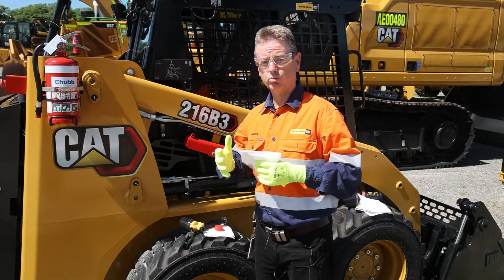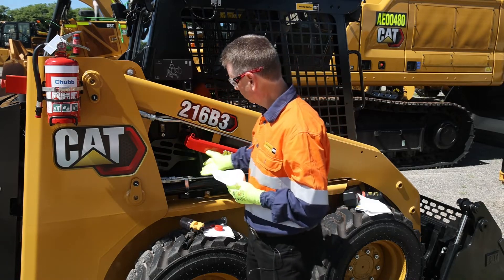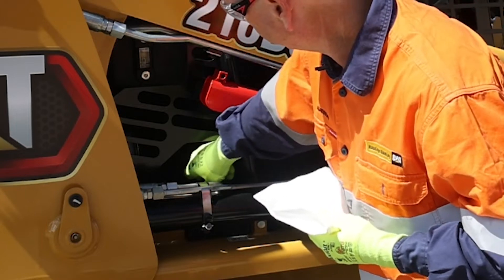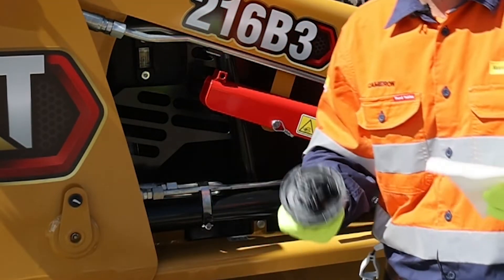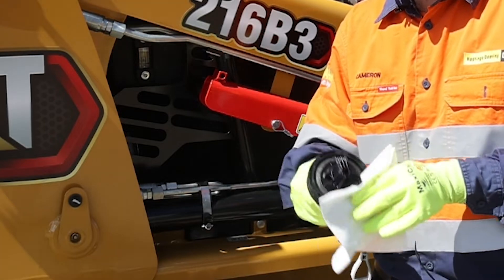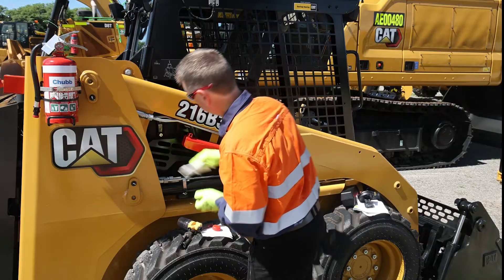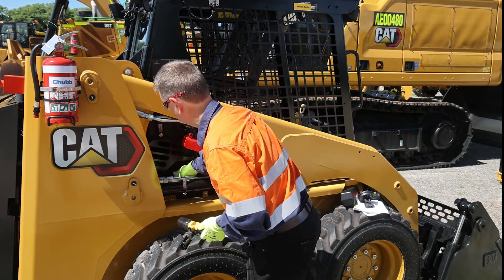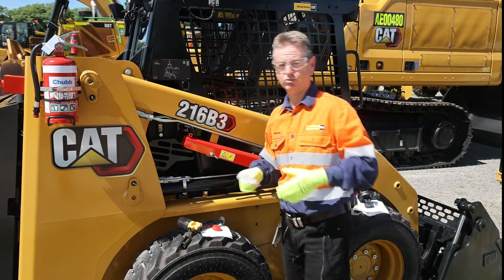We need to make sure the sample point we're taking the sample from is clean. We can see the tank down in here and the cap for the tank just there. When we remove it — we're fairly spoiled this time as it's a nice new clean machine — we'd typically wipe around here and around the surface, making sure there's no dust so we can get into the tank while taking the sample.